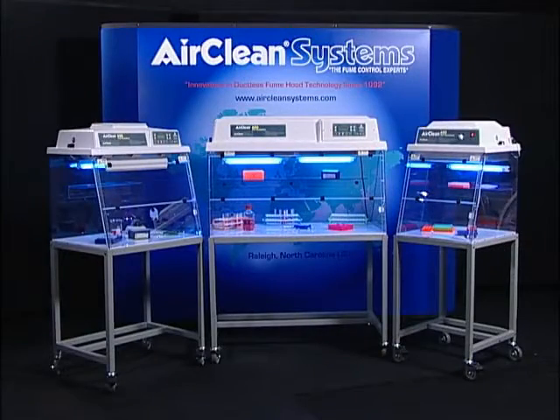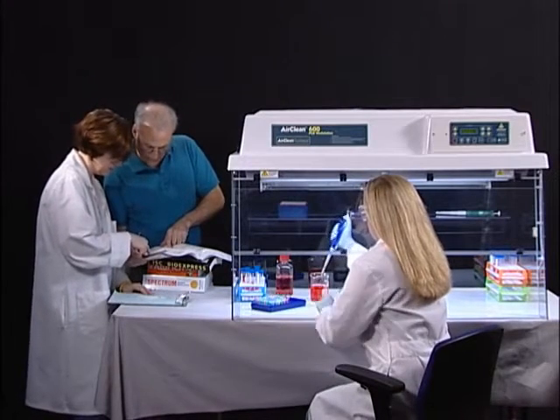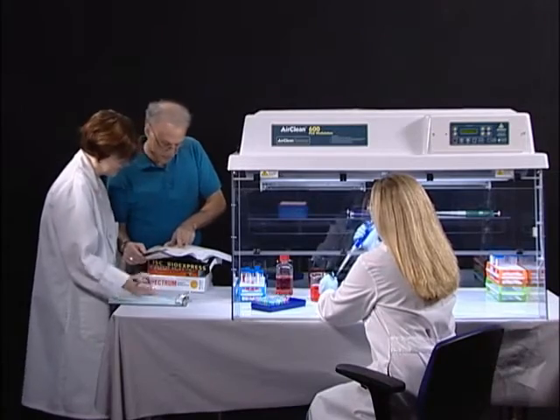AirClean Systems PCR workstations offer a controlled environment for the amplification of DNA and RNA. By incorporating an AirClean Systems PCR workstation, you improve your odds and reduce the amount of reagents required to achieve your desired results.